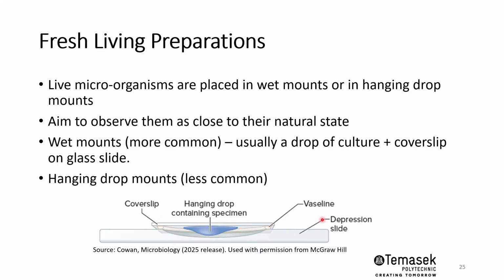This is less common in the industry now in the microbiology lab. For example, we hardly do hanging drop now unless the specimen is of small volume or difficult to visualize under a wet mount. A more common wet mount will be sufficient for most of the specimens.